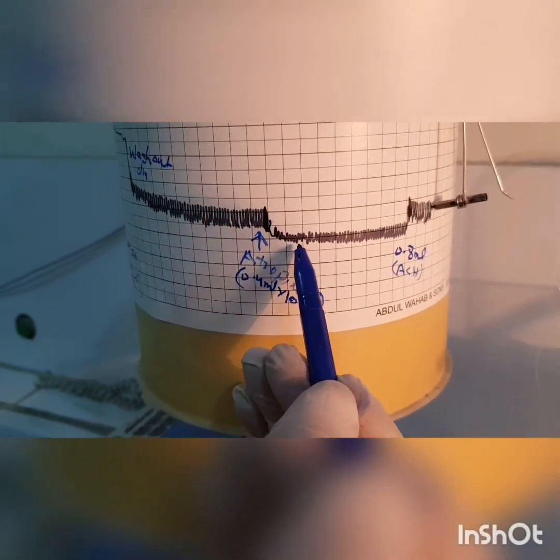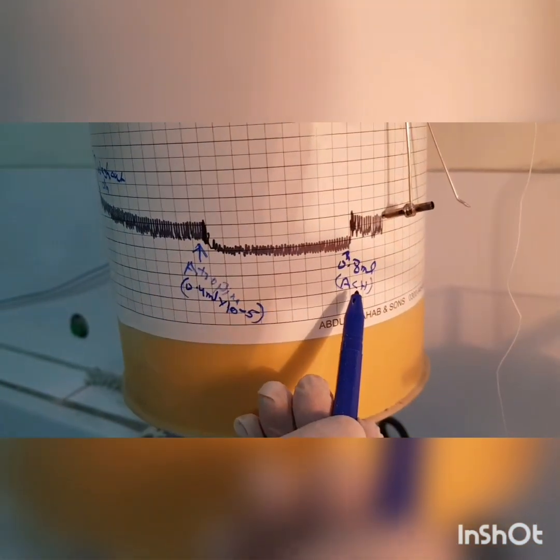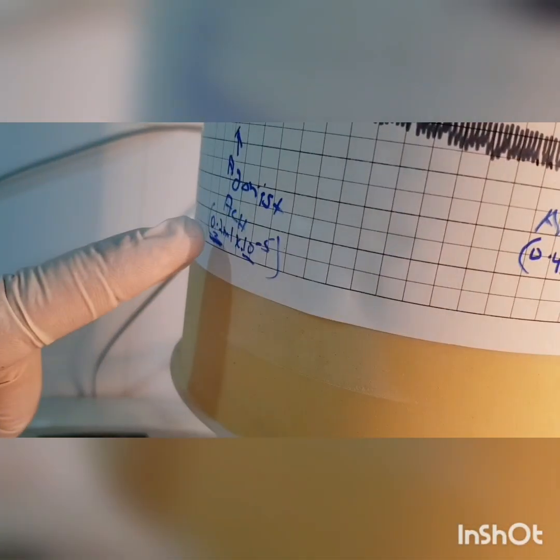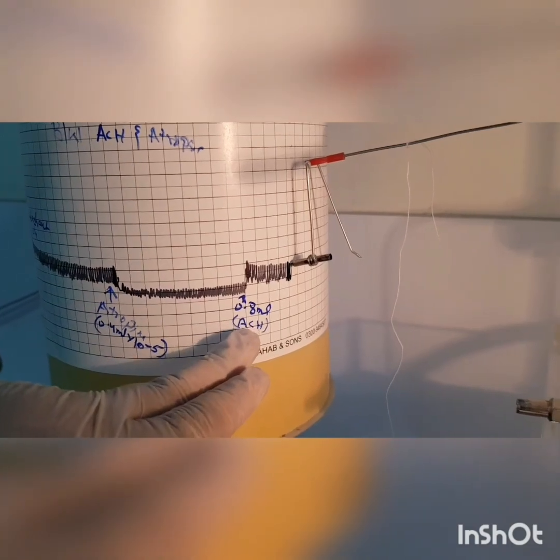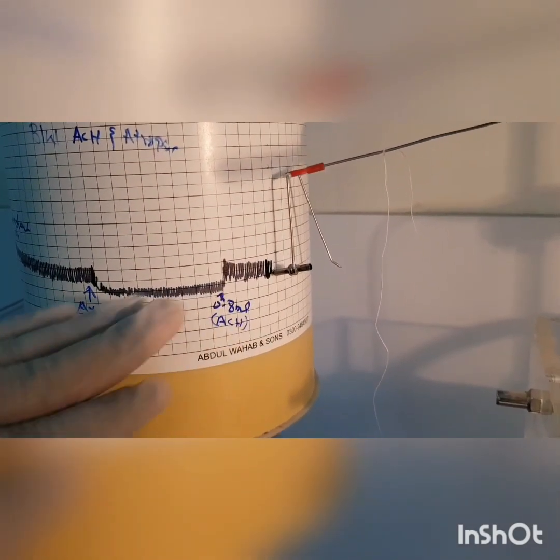But here in the presence of antagonist, the antagonist shows some effect, then we give the agonist, which is 0.8 ml. The effect is less, because in the presence of the antagonist, the agonist shows some effect, meaning that the receptor is partially blocked.